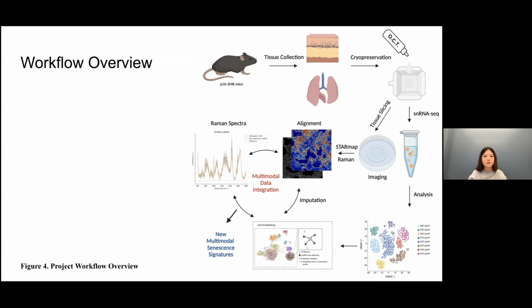Finally, through the multi-modal integration of transcriptomic and Raman features, we can then discover new senescence signatures. These signatures represent unique molecular patterns associated with aging and senescence, which offers valuable insights into how these processes affect tissue on a cellular level.